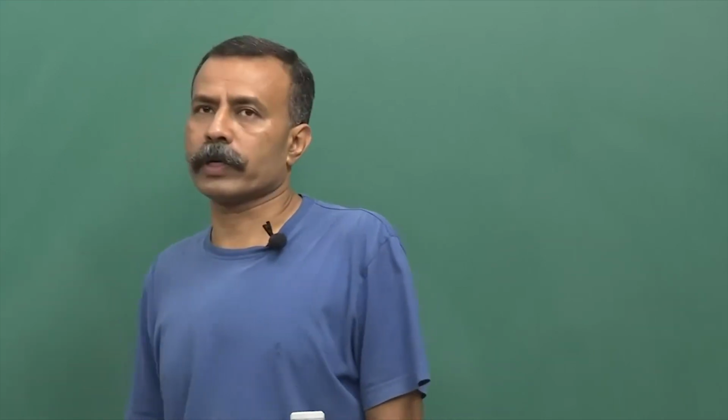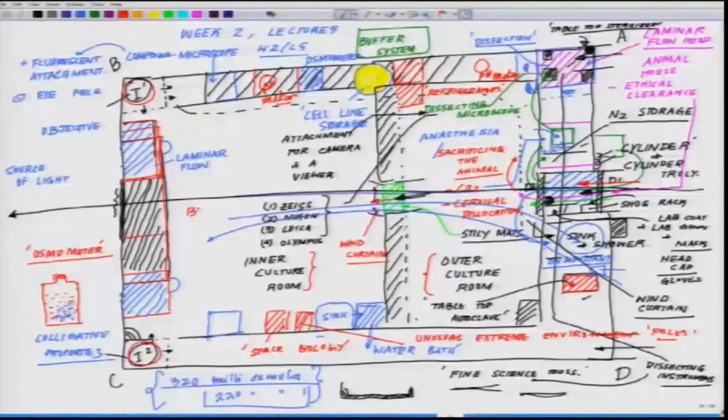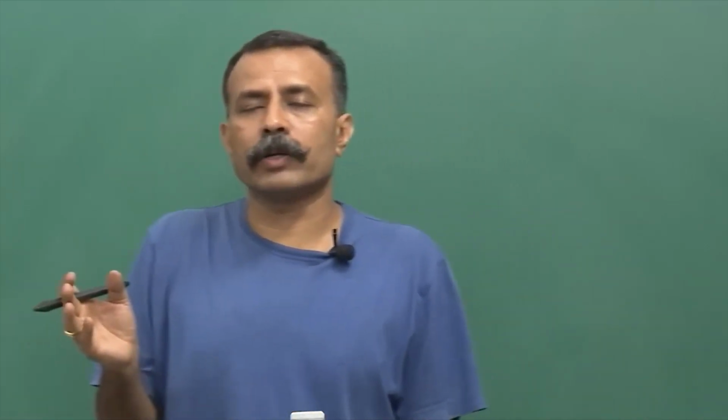integrating cells on microstructures, which you must have heard of as biomems. M stands for micro, E stands for electro, the second M is mechanical, S stands for system. Biological micro electromechanical systems. These are essentially microstructures. And we'll be coming to it later.